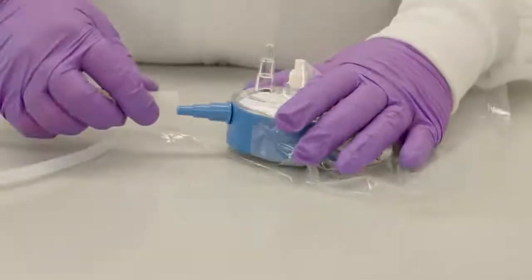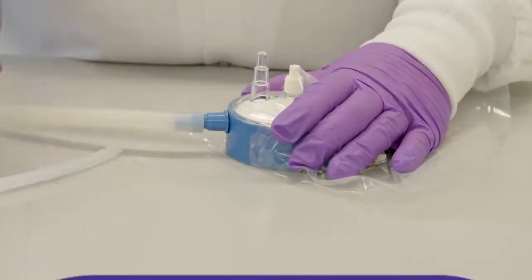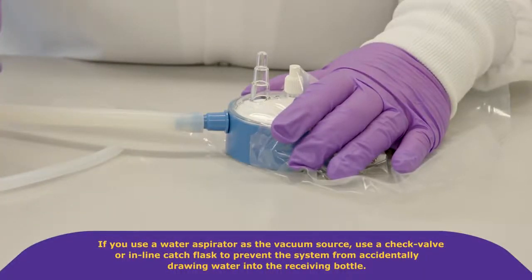Attach the blue vacuum port on the side of the unit to a regulated vacuum source. If you use a water aspirator as a vacuum source, use a check valve or inline catch flask to prevent the system from accidentally drawing water into the receiving bottle.